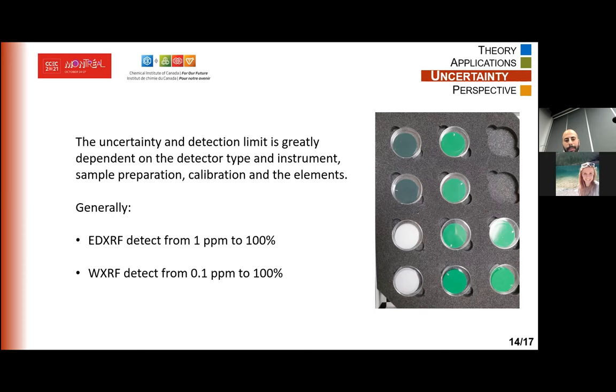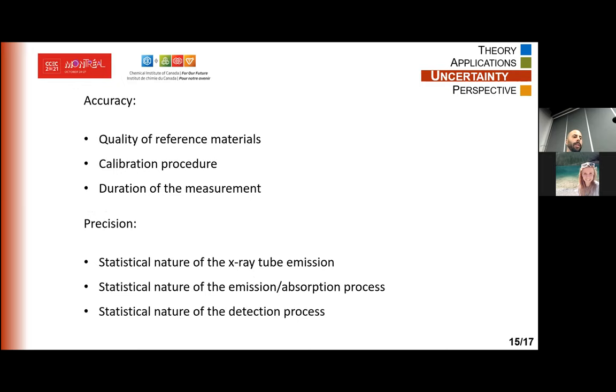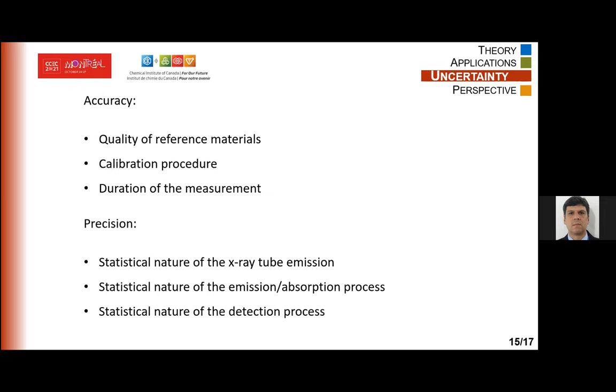So the accuracy will depend on the quality of your reference materials, but nowadays it's pretty standard, it's not difficult. Your calibration procedure must be the right one. It also will depend on your element, your machine, but it shouldn't be that difficult. And the duration of the measurement. Again, that's something that you can change easily.